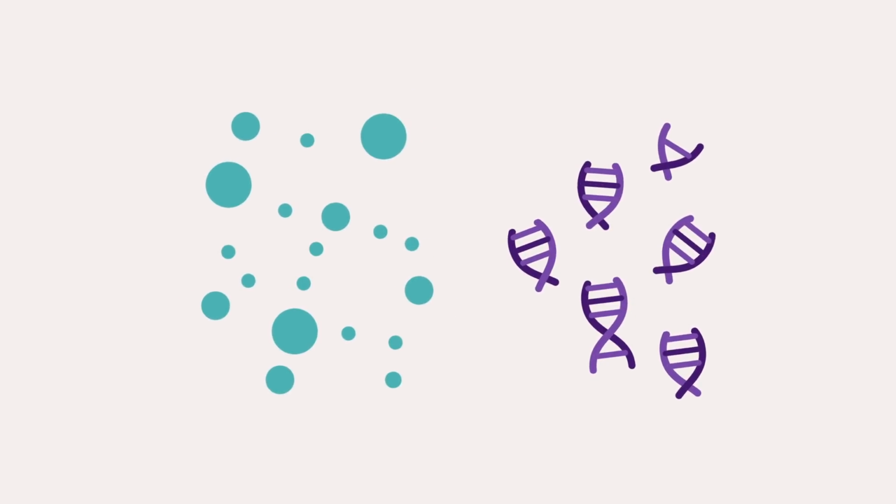You still with me? Yes. Cracking, copying, chopping, done. Next, we need to clean up your DNA. We spin your fragmented DNA really fast to separate all the stuff we don't want, like leftover cell junk. And after this, we're ready for the next step, staging for analysis on the genotyping chip.